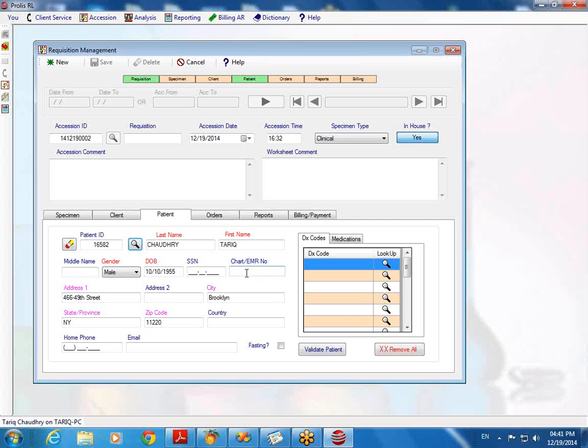So an institution can send us a tumor sample, and we take a little bit of it to do our testing. But the rest of the tumor sample, the institution will want back for various other reasons. So we need to return the leftover sample to that institution. What I'm wondering, does Prolis have the ability to track when that sample was returned or had left our lab?